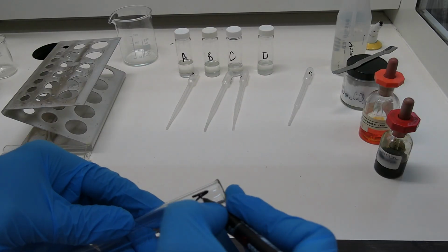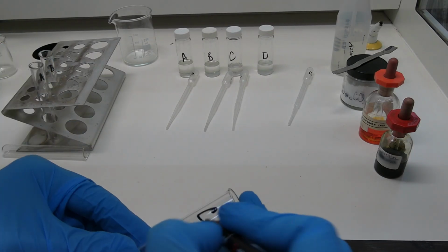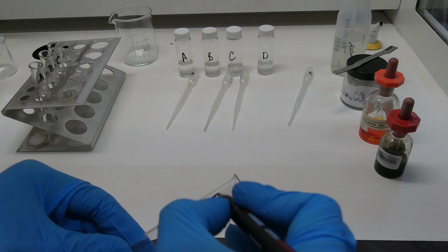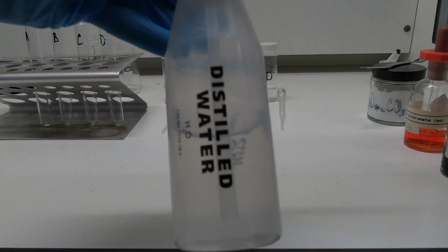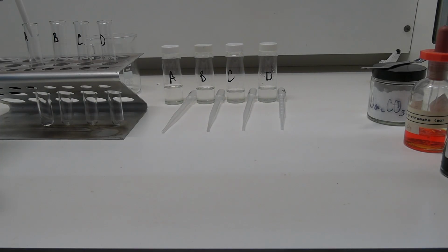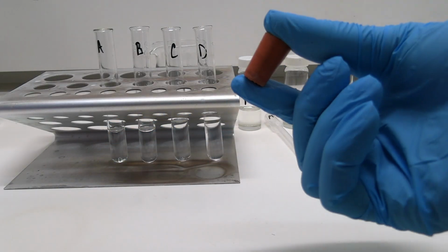Test 1. Solubility in water. Label 4 test tubes A to D and place them in your test tube rack. Then, fill each to about a quarter full with water. And cover them with rubber bungs.